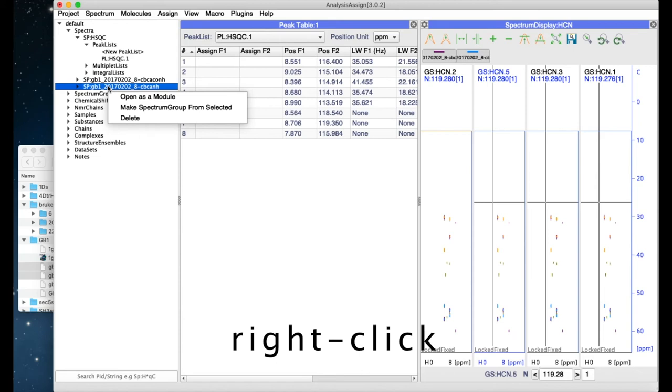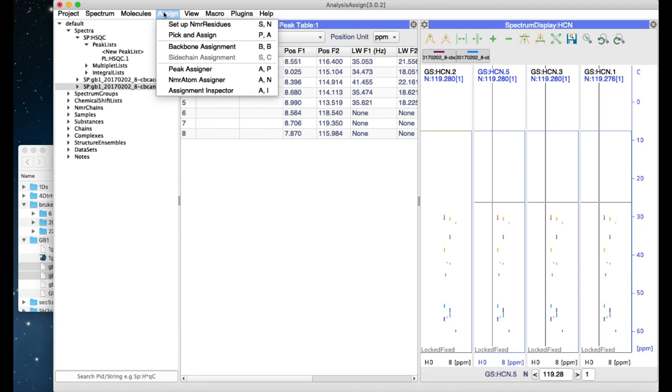The program uses two-key keyboard shortcuts. These are shown in the menus on the right-hand side. Simply type the two letters without a comma and lowercase in order to bring up whichever module you would like.